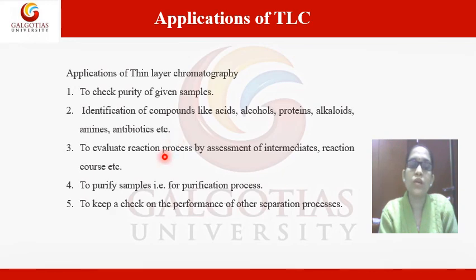Also we can apply TLC to evaluate the progress of a reaction, by assessment of intermediates or reaction time. So the progress of a reaction can be evaluated by applying TLC.